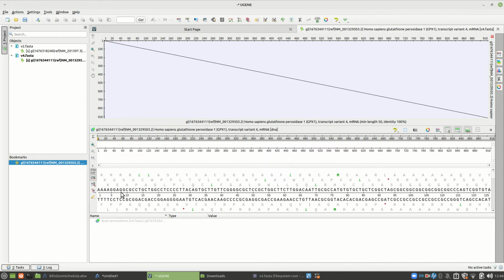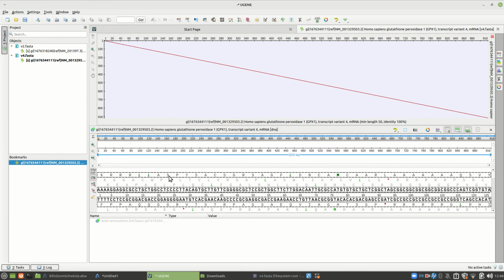The start codon is, all right, we're looking at this whole thing. It's the first methionine in the sequence. So we are down here at 1. And so where is the first methionine that you run into? And it's here. Is this the one that we saw, that we chose? Make sure. ATG right here. And before it is a C, and after it is a T. Let's go see if that's it. It's surrounded by a C and a T.